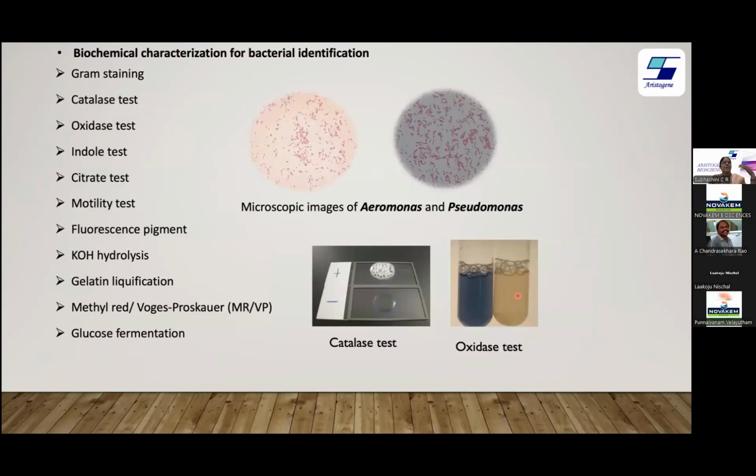Okay. Now we have the plate in which you plated your organisms, and you have a single type which is inoculated into the LB or TSB broth. So now you have different colonies which are present as 5 ml culture. So what is the next step we do? We first do gram staining. I hope you all know what gram staining is.